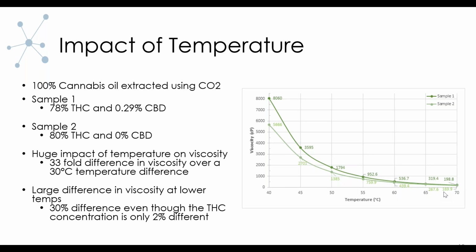So why does this matter? It matters in a few different ways. When you're formulating your cannabis oil, you want to understand what the viscosity is as it's getting closer and closer to combustion. Some negative impacts of not knowing the viscosity as temperature gets higher are that you can have leaks, insufficient burning, insufficient vaporization, or you could have burning, which are all very negative in terms of the customer experience.